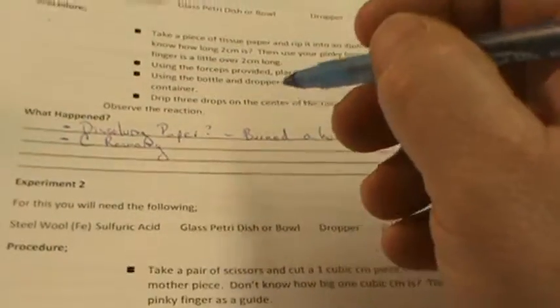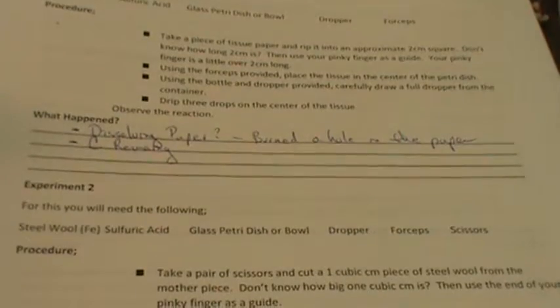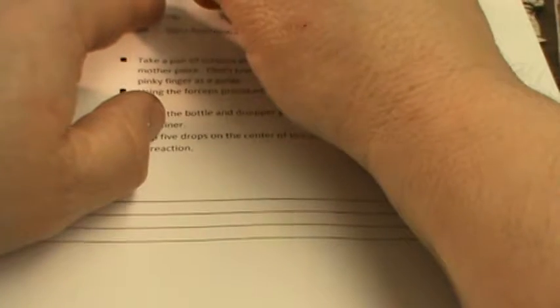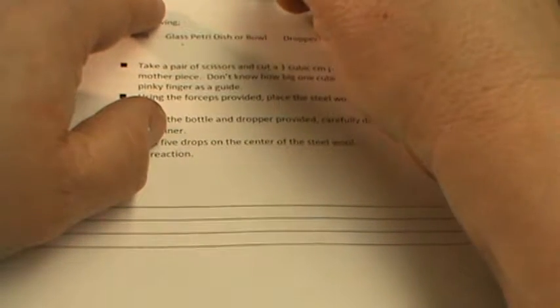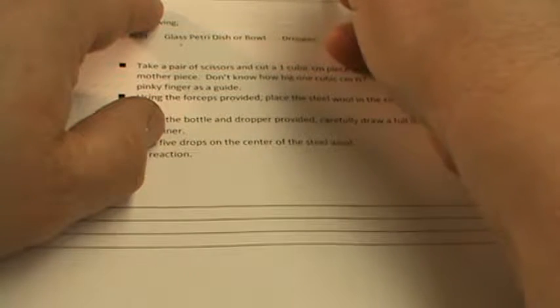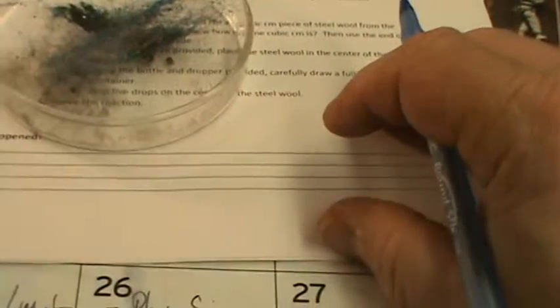So, what did we observe? I didn't get a smell. I had some students who said they could smell the rotten egg smell of the reaction. I did not. And in this case, the reaction was almost instantaneous, almost instantly.